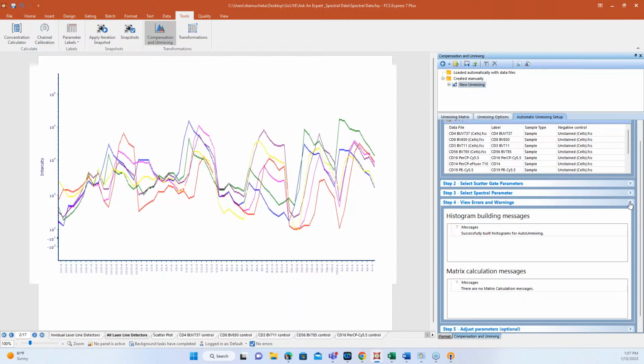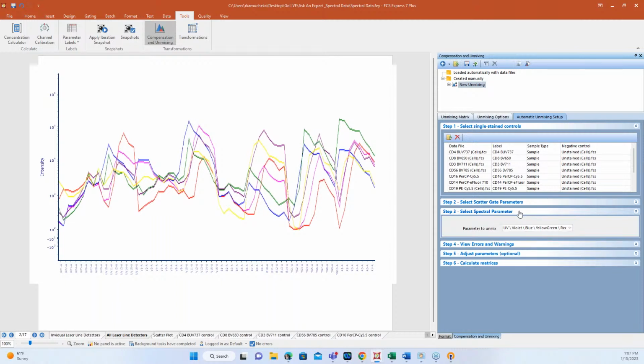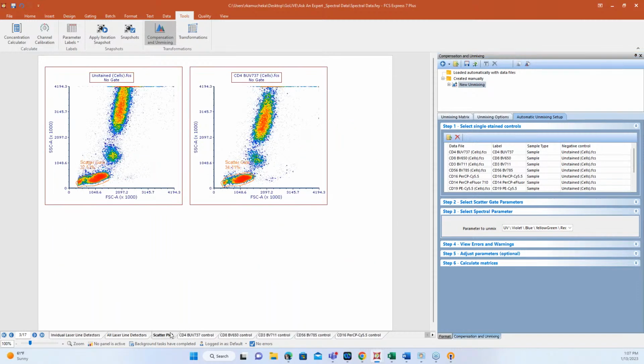Yeah, I think the other really great thing about this, like with compensation, is that if you have mixed media type samples going on, so you've got some beads, you've got some cells, it's really super easy to add all the controls for those and to do all of those in one unmixing experiment. So no need to be intimidated by that either. The wizard makes it really easy.